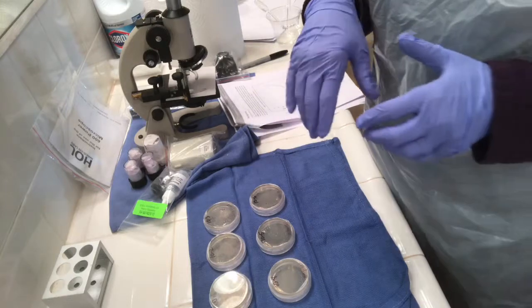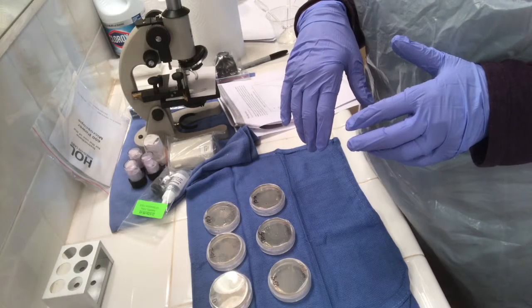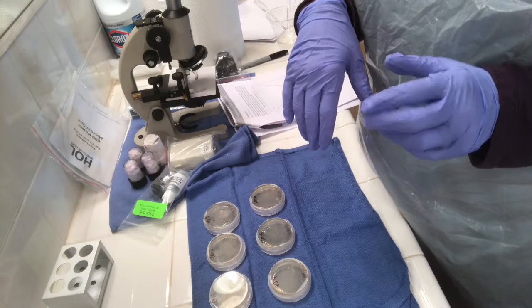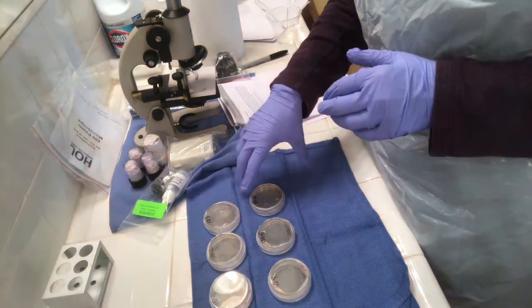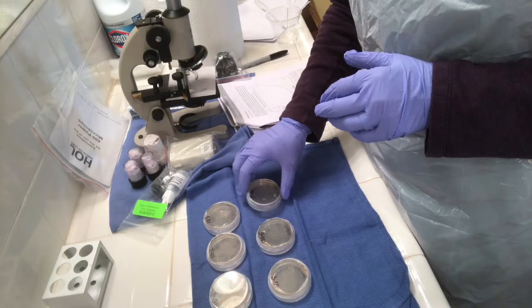And the point to that is for microbiologists to get a good estimate of the main solution's amount of microbes that are in there, because there'd be too many to count on their own. So by diluting it, it would make it easier to figure out the amount of the parent solution.